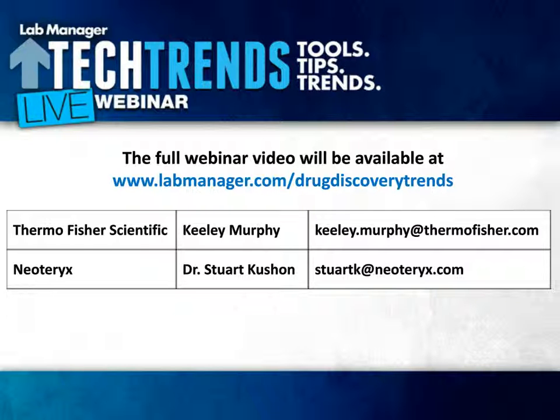Alternatively, if you saw the liquid-liquid extraction approach that was used by Bristol-Myers Squibb, they're using a mixture of ethyl acetate and hexane for their liquid-liquid extraction. That's also a fairly nonpolar solvent mix. From general chemistry, like dissolves like, and so the approach to extraction of hydrophobic analytes is generally the use of a more hydrophobic solvent, either through a solid liquid extraction approach or a liquid-liquid extraction approach.